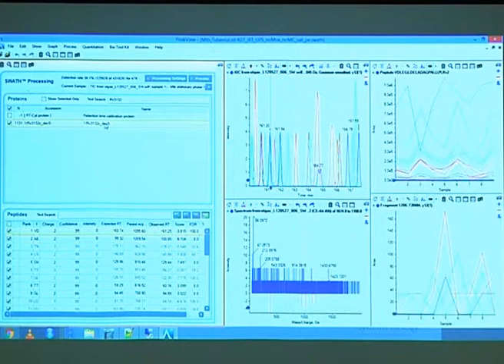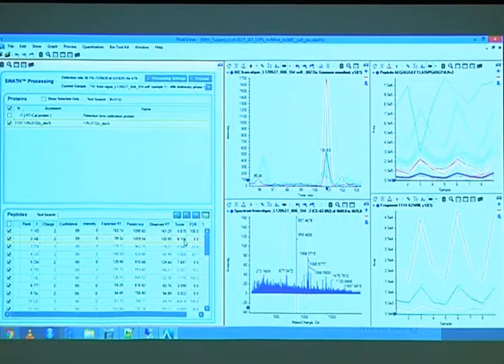I thought maybe I have to activate it again. So now you see I've selected an entire protein, and it displays here all the peptides of that protein. What you can see here is that most of these peptides show the same profile as we've seen for the transcription factor. So for each of them, it's low and then goes up, low and then goes up. Also, in that case, it looks that bad because that was actually not identified here. Let me pick a nicer example. There we go.